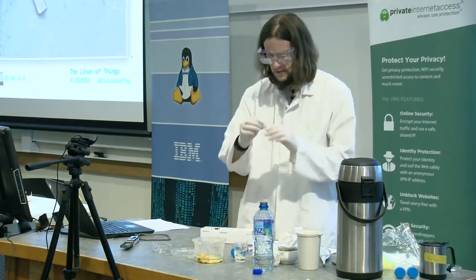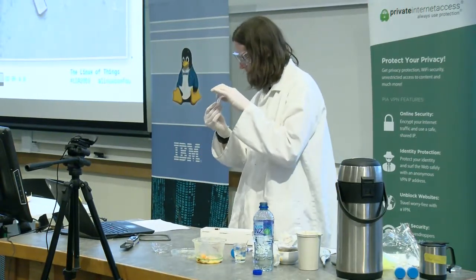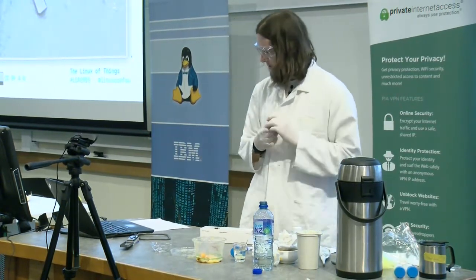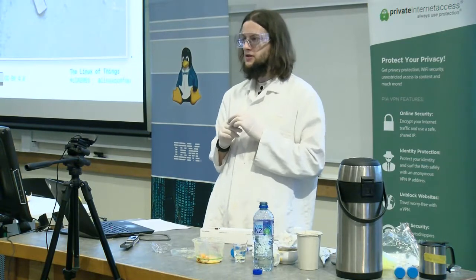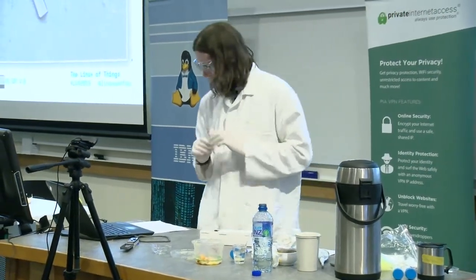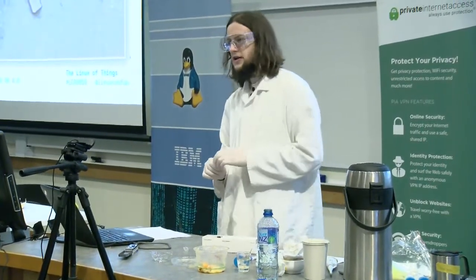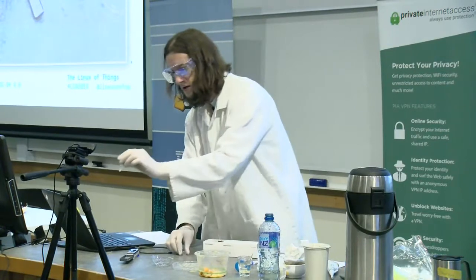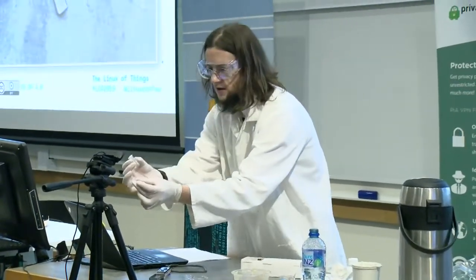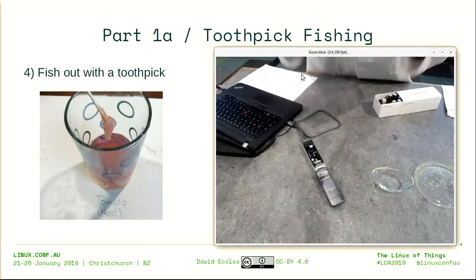In this case, I actually prepared some DNA in a lab in advance last week, just in case the extraction didn't work today. So our sample today will get barcode number 1, and the mishmash from a week ago will get barcode number 2.